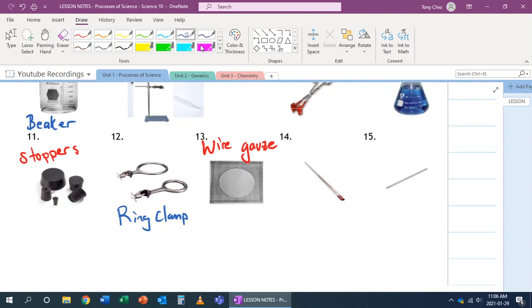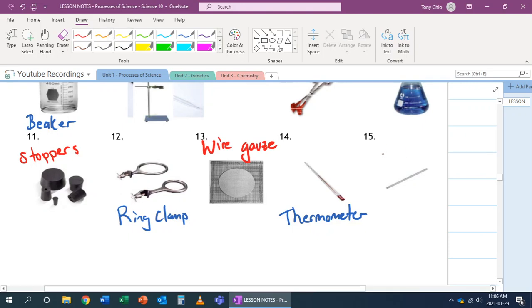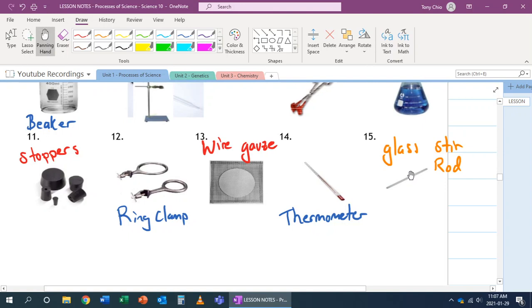Number 14 is called a thermometer. It's used to, as you know, measure temperature. 15 is called a glass stir rod. It's used to mix things in, for example, a beaker. Now, why is it made of glass? Glass is fragile. Why is it not made of metal or plastic?